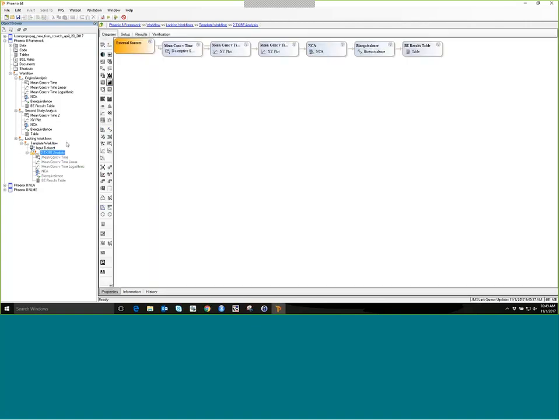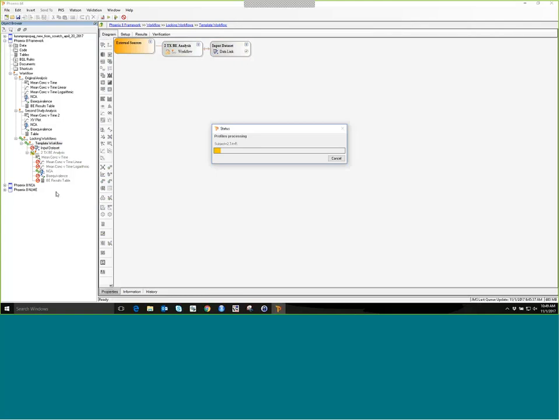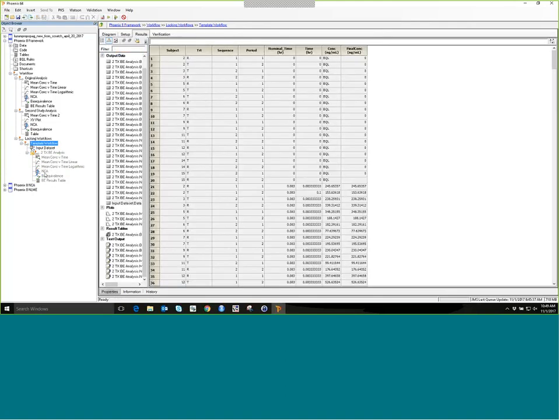So you can actually run a locked workflow, and you can execute it, and it will go through and execute everything, but you can't make any changes to that workflow. You can also take the output of a locked workflow, and you can send it to a new workflow. So if I wanted to take output from any of these and send it to a report, or I wanted to export it, I could.